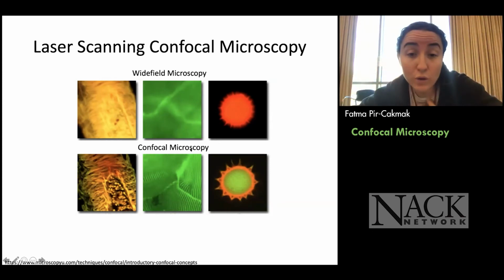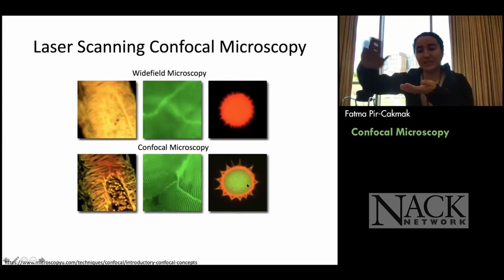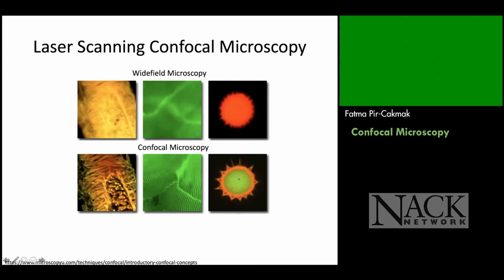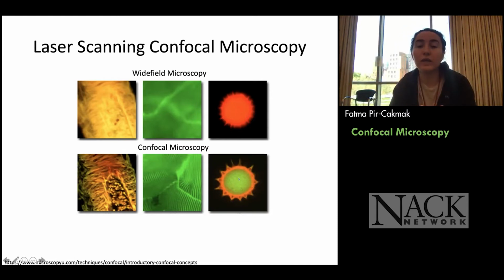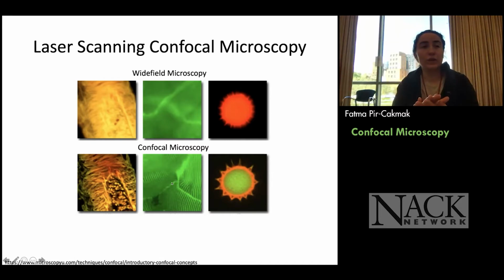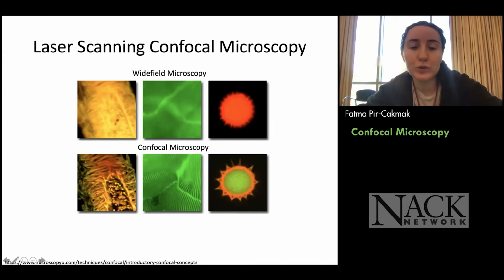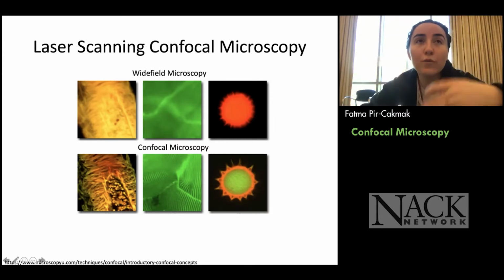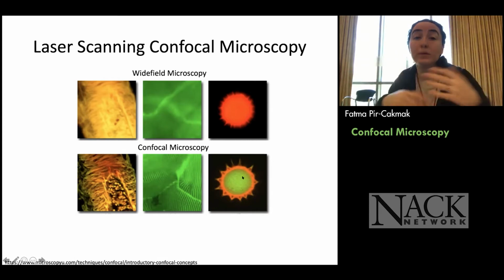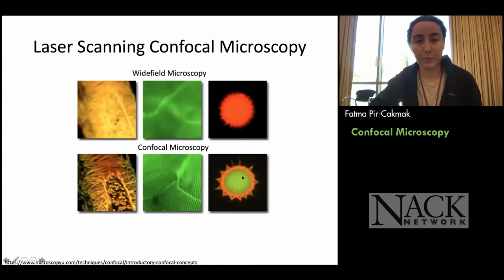But if you use confocal microscopy, you will be able to slice. For instance, you will be able to see a slice like this here. You will also be able to collect the data inside of the sample, and you will have better resolution because you're looking at a tinier plane, and it will help you get more information about your sample. That's why people want to use confocal microscopy.